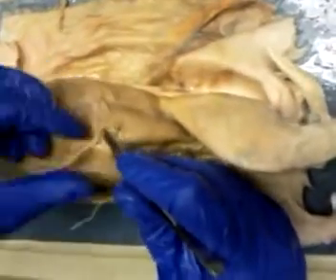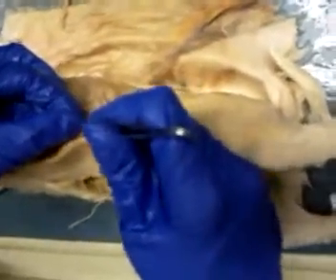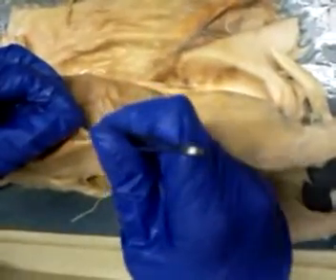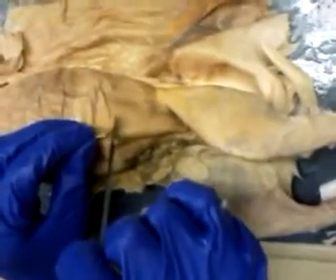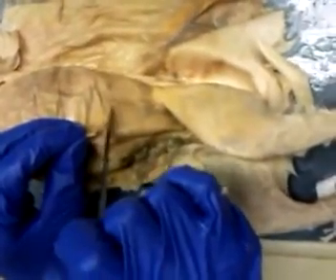Okay. Here's a layer. It's kind of like what a doctor's doing for grafting. No, this wouldn't be a skin graft. This is muscle. But you're right. It's that kind of shallow cutting.